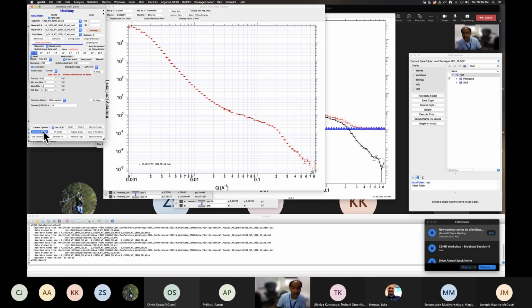Okay, so now I want to calculate this and show where. So that's where the length of your cylinder, that's the shoulder of your cylinder, but it'll be changed a bit. So 8 means it's actually 8 plus 3, because the minimum is 3. So let's say 5 plus 3, that's 8, and then calculate. So see, it's moved down there.